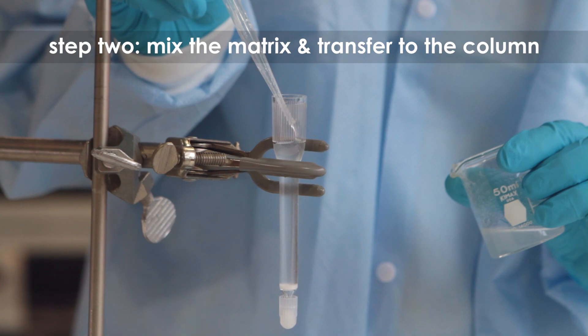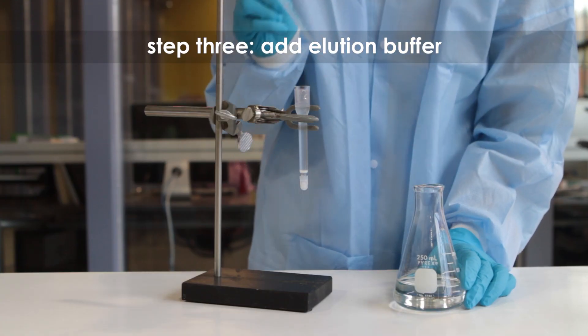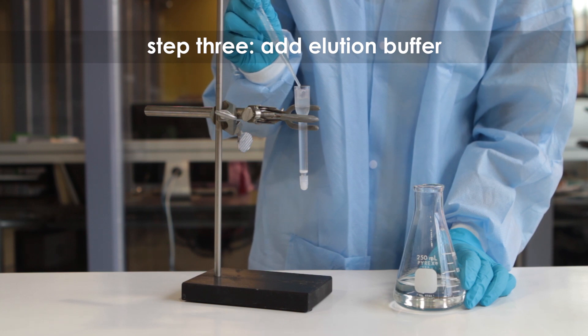Step 3: Using a transfer pipette, add elution buffer to the column's reservoir.